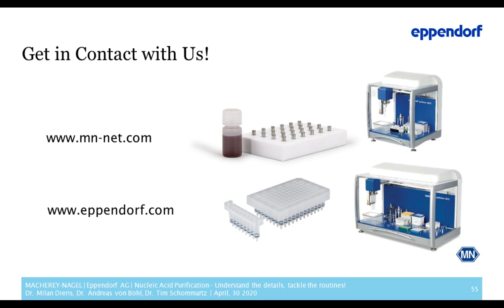Andreas, let's come to you for this next question. Do we need any extra equipment for magnetic bead-based nucleic acid purification? Basically what you need is a magnetic separator, which is available from a diverse set of commercial distributors or manufacturers. For the automation, it is recommended to have a thermo shaking device, which is usually equipped on a couple of platforms from Eppendorf, and you need a gripping device to move the plates from the magnetic separator to the shaking device. Of course, you can also do this manually. Then you only need a magnetic separator and a pipette.